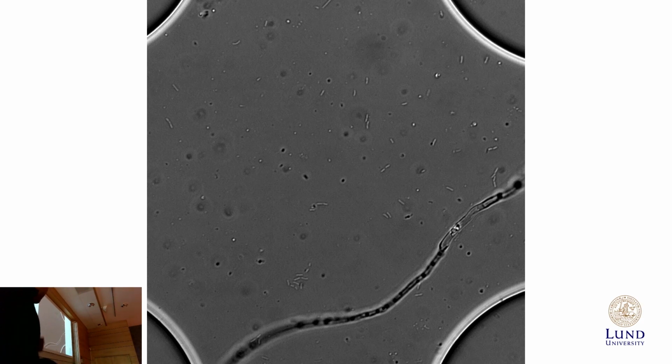But when we try to identify them by ourselves, for example here, looking at this bacterial cluster and this fungal hyphae, we first examine the edges and the corners. Then we move to more complex features that tell us, oh, this is a bacteria, maybe this is a protist. This idea of moving from simple features to progressively more complex features reminds me of convolutional neural networks. So we considered that if we use deep learning, it will give us more robust results, and we could analyze large data.